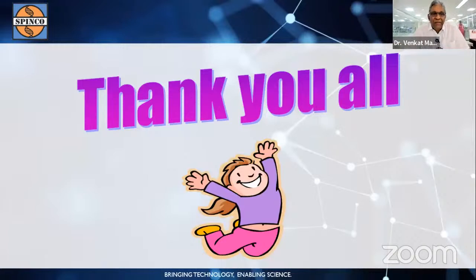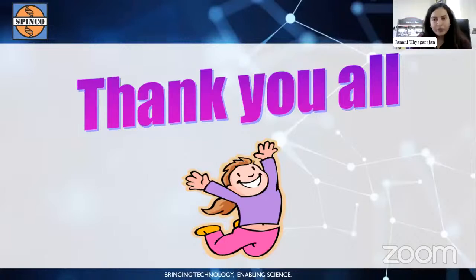I can do that. We'll plan how we can do that. Okay. So now we will have a poll of 3 questions that is related to what we have learned. So the first question is: electrospray ionization produces option A, M+1 ion, option B, adduct ions of the molecule, option C, M+1 ion and mostly adduct ions, or D, molecular ion only. Please select the best possible answer according to you.